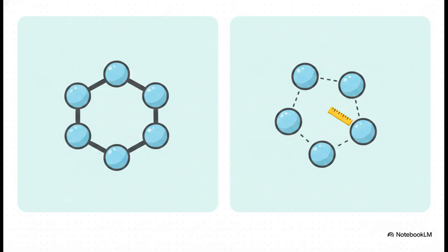But through-space dipolar interaction, which is the engine behind NOE, maps 3D proximity. It shows us which protons are literally just sitting next to each other in space, totally ignoring the chemical bonds between them. They might be 10 bonds apart, but if they're folded up next to each other, this effect sees it. We absolutely need this different phenomenon to get that through-space measurement.